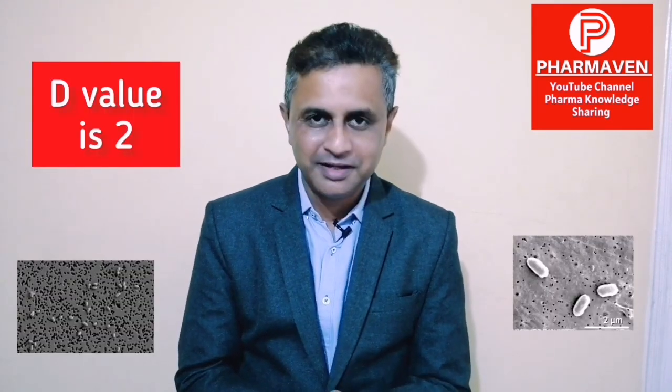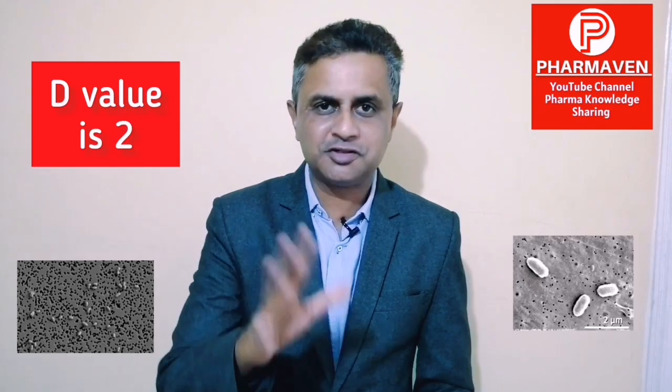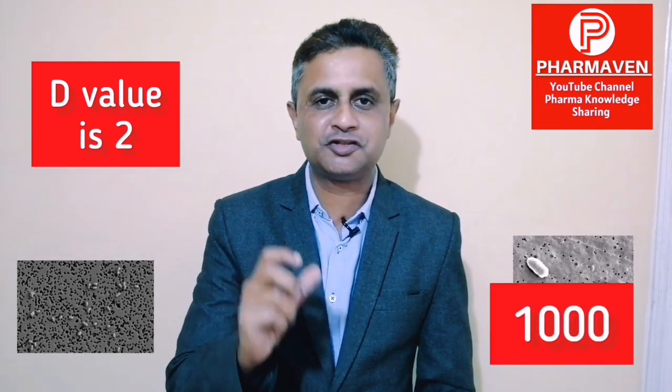So let us first understand what is D value. In simple terms, I'll give you a very simple explanation to make you understand what is D value. When I say D value of a specific microorganism is 2, just for example, then what does it mean? It means that if the microorganism population is 1000, and I say D value is 2, then at a specific temperature, let's say 121 degrees.